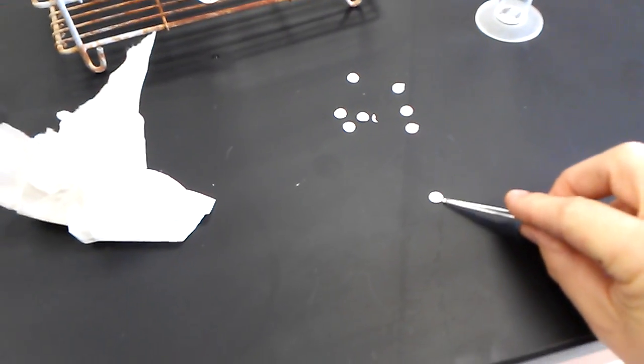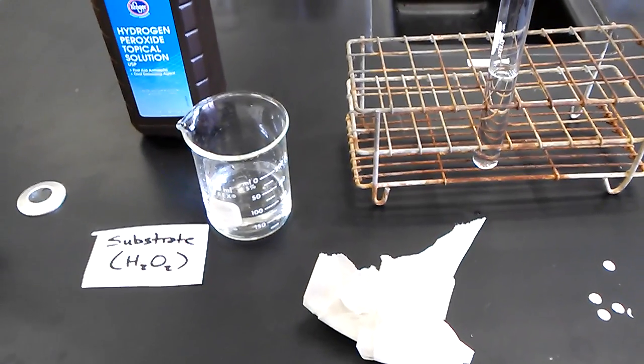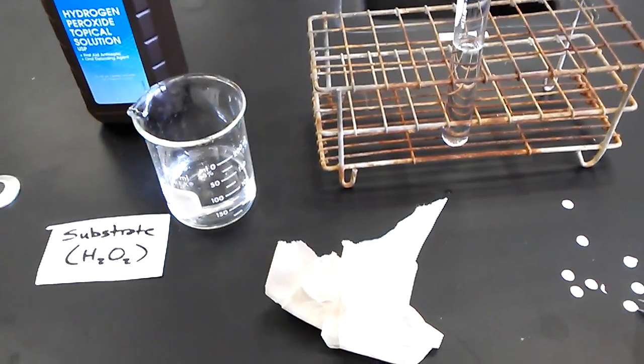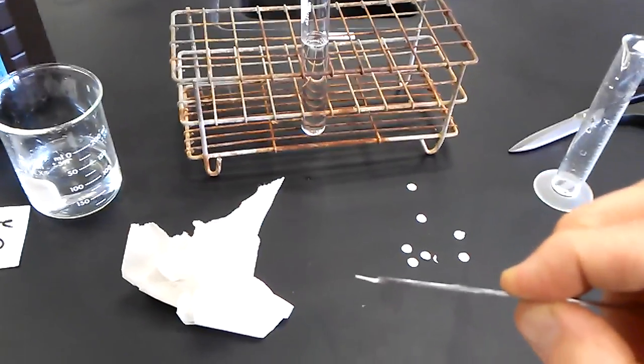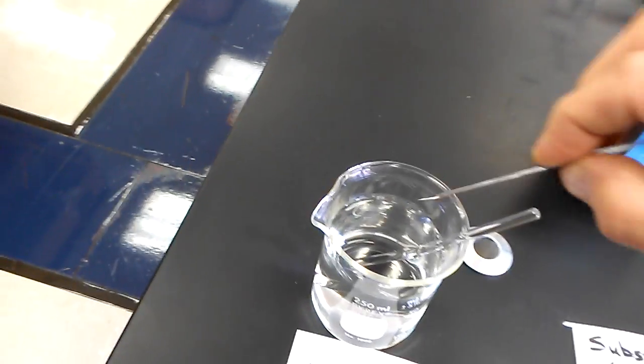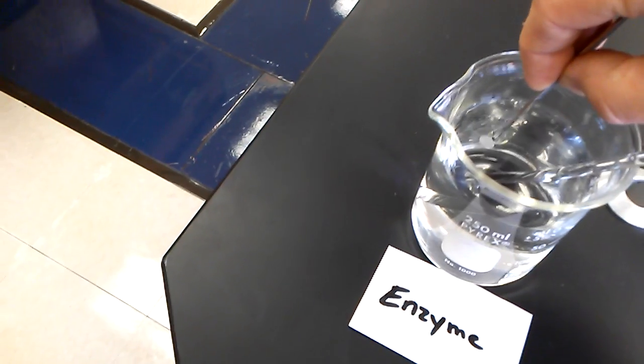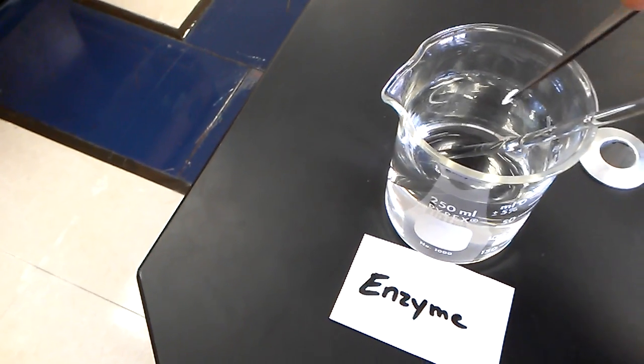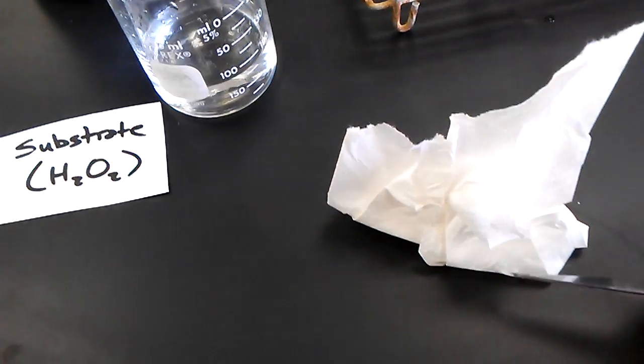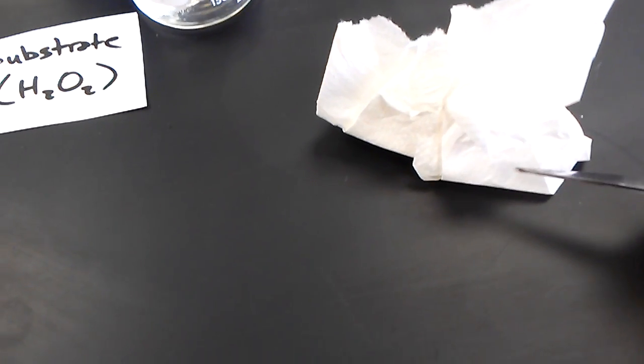Now, we will obtain a filter disk. These have just simply been punched with a hole punch. And we will then soak these in our catalase solution for a moment. And then we will touch these to a piece of dry paper towel simply to absorb any of the excess off. That will give us a consistent result each time.